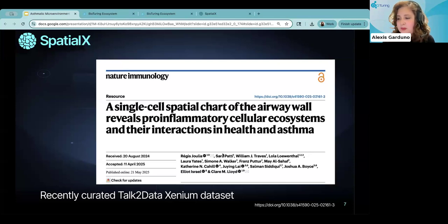And they tried to answer very specific questions like, are there any inflammatory hubs that we were able to identify? Are there any tissue compartments where we see mucus glands and surface epithelium enrichment? And can we look at these signaling gradients across these different tissues? That's something the authors tried to uncover. But again, there are a lot of other functionalities we can utilize, such as how to quantify proximity of these cells, neighborhood structure, and looking at spatial gene expression across these different gradients.